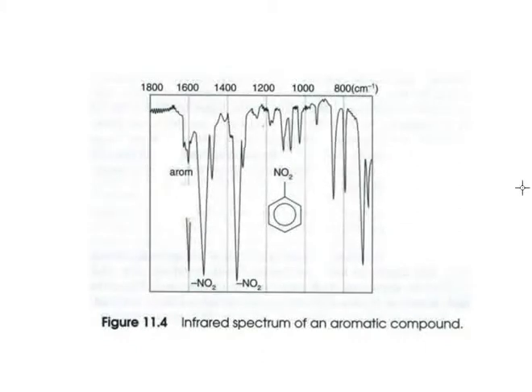The next spectrum. This spectrum is not the complete spectrum. It's of nitrobenzene. And one thing to point out with respect to this spectrum is the peaks for the aromatic ring. Now it also mentions the nitro group, but I don't want to focus on that so much. This is the structure of a benzene ring, and there are hydrogens at the various carbons. They're not shown.